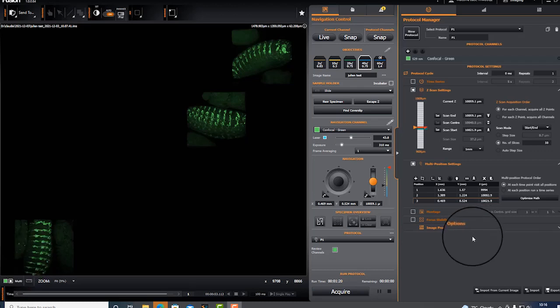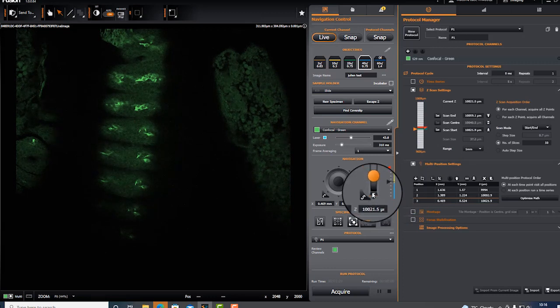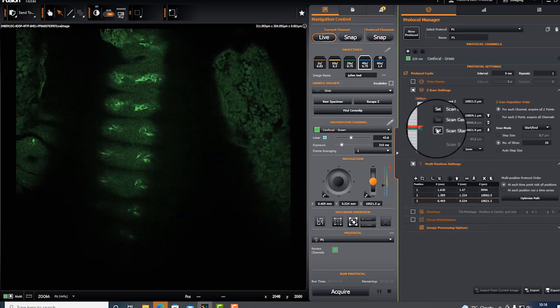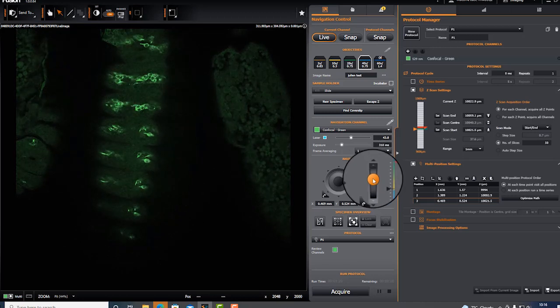So to summarize, you select 3 different positions and you select the start of your scan at each of the positions. As you can see here, the start of my scan was different in all 3. Then you select any one of them and you go to the position and you press live and you define the start of your scan, and if it's different, you need to replace, and you press this is the start and you define the end of your scan.